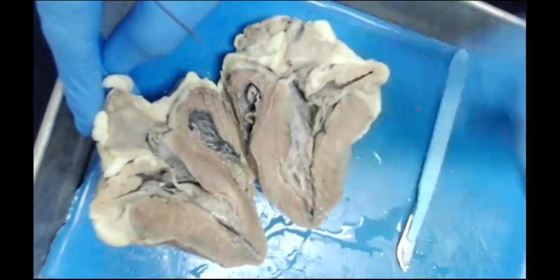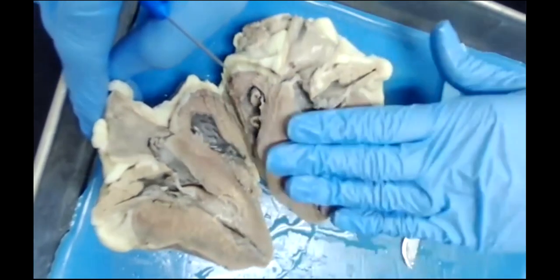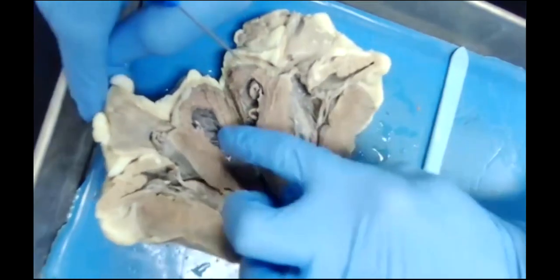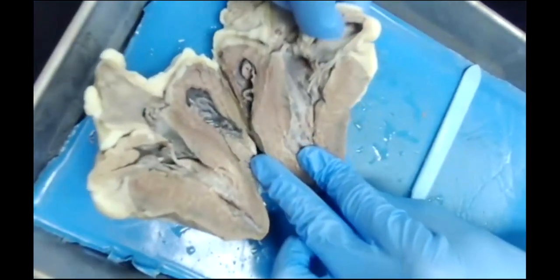So the atria contract, send blood into the ventricles, and the ventricles contract, sending blood either to the body, which is the case for this side, or the lungs, which is going to be the case for the other side, the side which is kind of thinner here. So yeah, here you have this nice view of our atria.